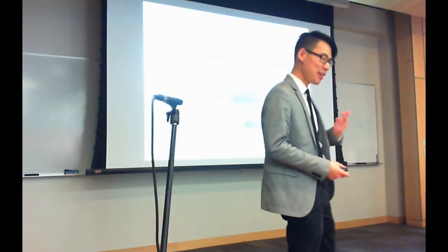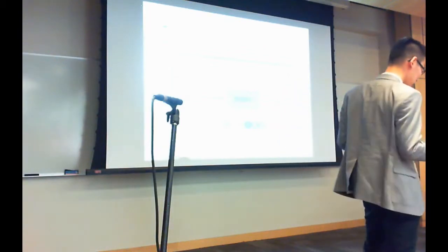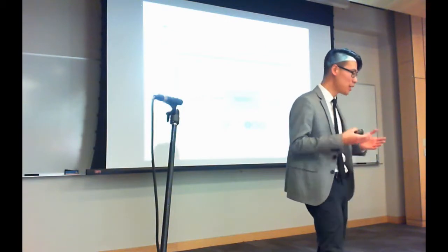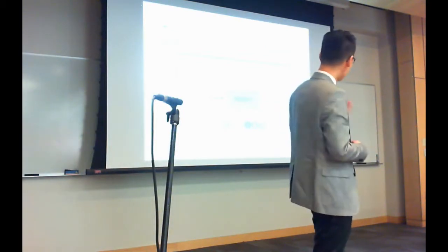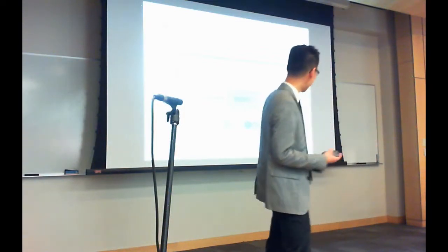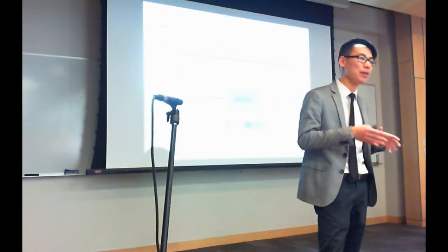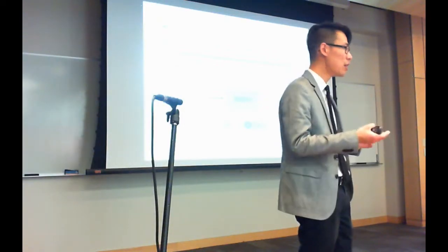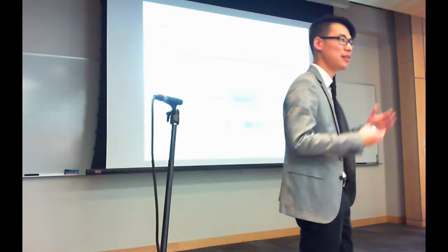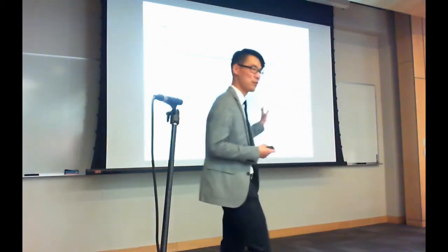Unfortunately, you can't do this. At this scale, if you naively start combining identification results, what you end up with is a huge mess. We want this library to be a reference set. But if you combine it naively, 28% of the compounds that you're seeing, of the peptides in this library, they're wrong. That's an unacceptably high error rate. You can't refer to this as a resource for the community.